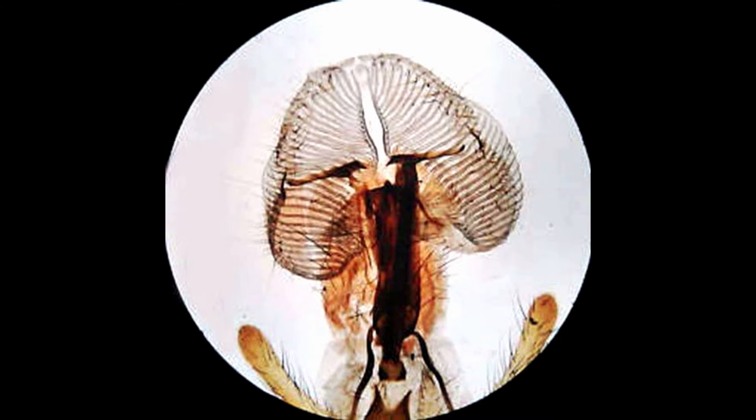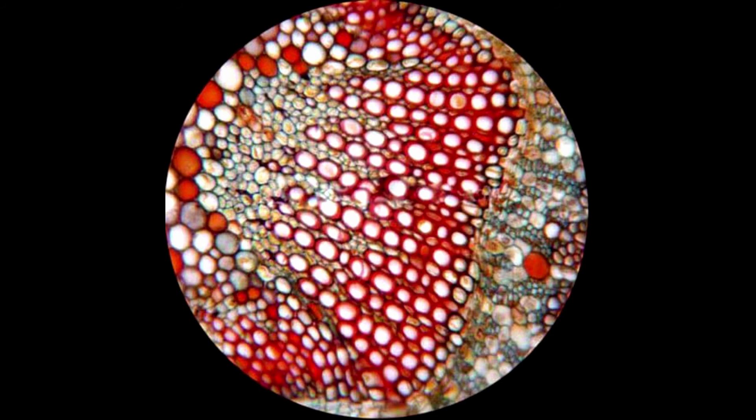The kit comes with sample slides, cover slips, tweezers, scalpel, specimen vials, adjustable lenses, collecting lamps, plus a sturdy hard case for easy storage and travel. This set is great for beginning scientists.